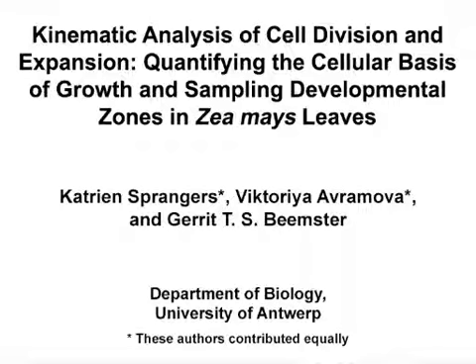The overall goals of this analysis are to determine the cellular basis of maize leaf growth and to use these data to investigate molecular growth regulatory mechanisms by performing developmental stage-specific sampling strategies. This method can help to address a key question in plant developmental biology.